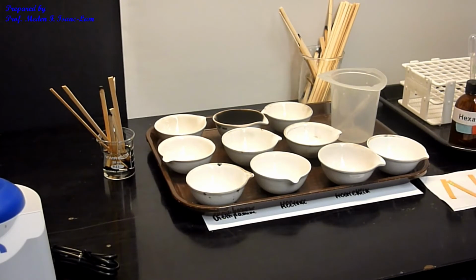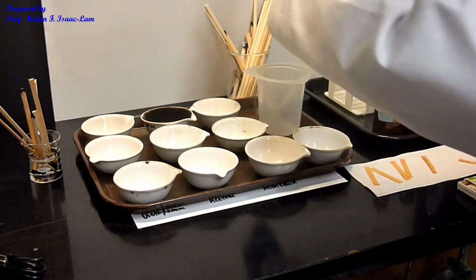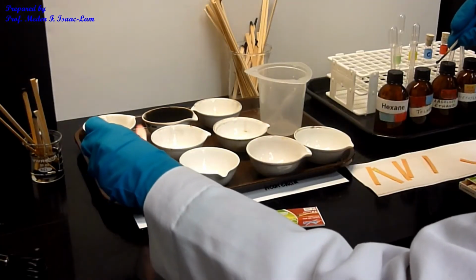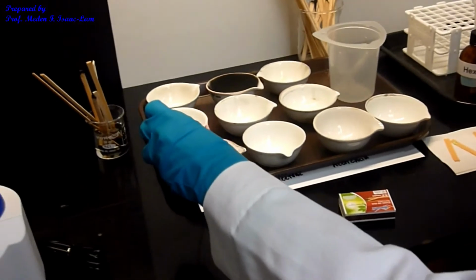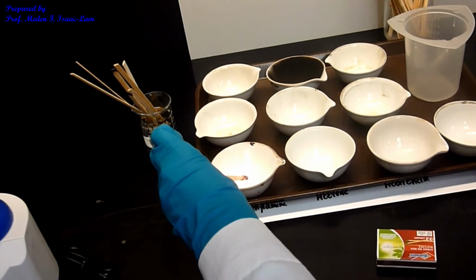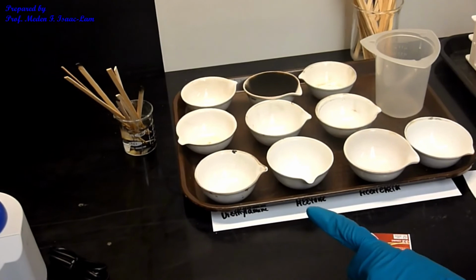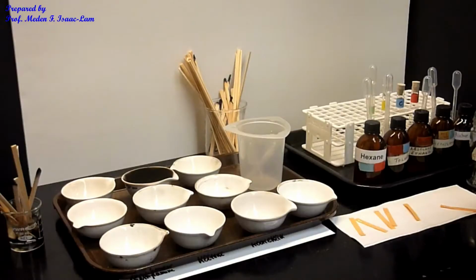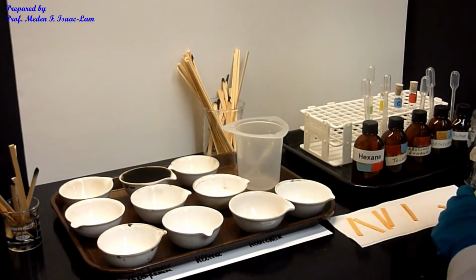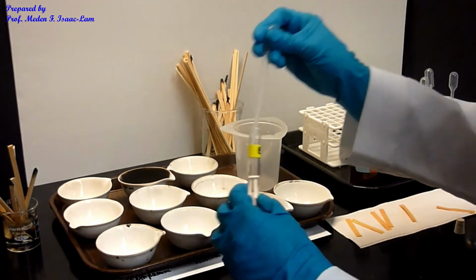And then we're now going to do flammability. So flammability, so it's flammable. Okay, and then you can do, by process of elimination, the size of the flame and then the appearance of the flame. Okay, that was unknown A. Okay, so unknown B. Unknown B is now going to be this one. Okay, so unknown B.